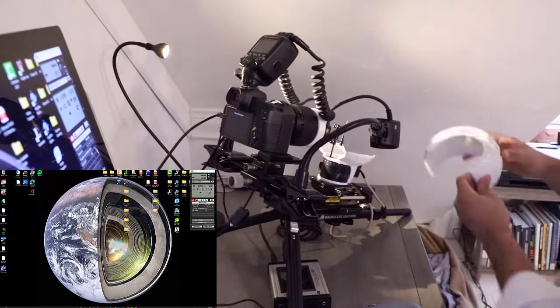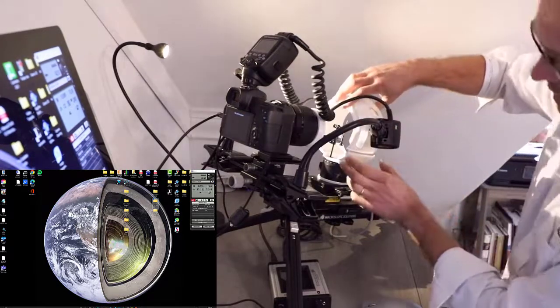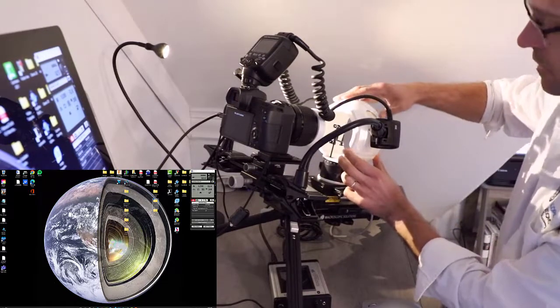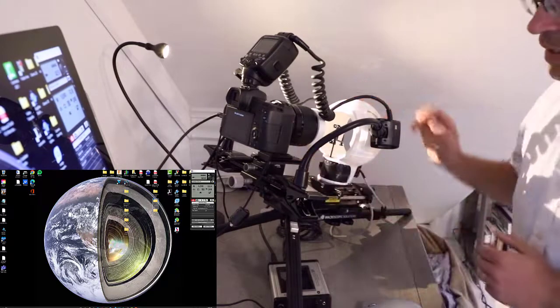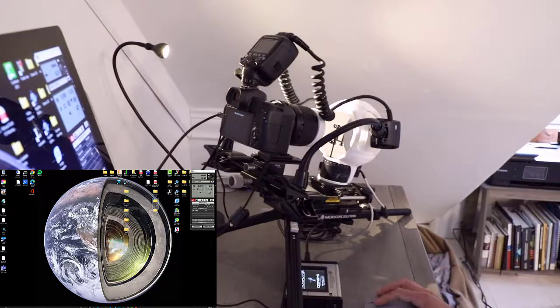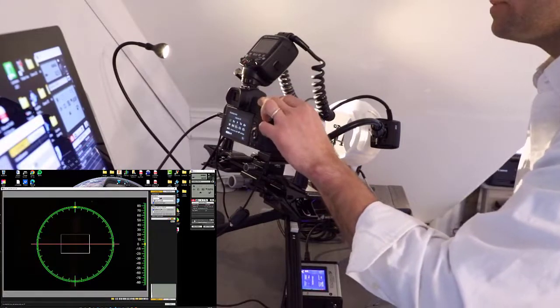And there's a couple of different ways you can go about doing this. Typically, these flash arms are not something we've ever had, but they do give us a little bit more flexibility when we're working with different types of specimens. So I'm just going to place the top on here, and we're going to power on our controller, which is the Cognisys StackShot, and we're going to open up live view so that everyone here can see what it is that we're doing.